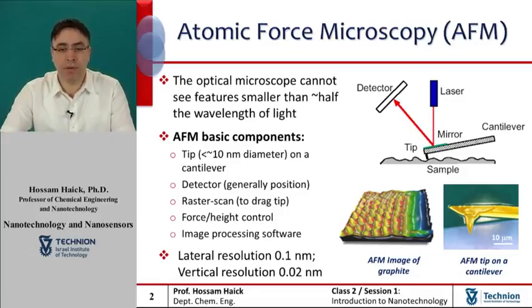The resulting map that represents the topography of the sample can then be achieved. Advanced AFM tools can reach a lateral resolution of 0.1 nanometer and a vertical resolution of 0.02 nanometers, more or less.